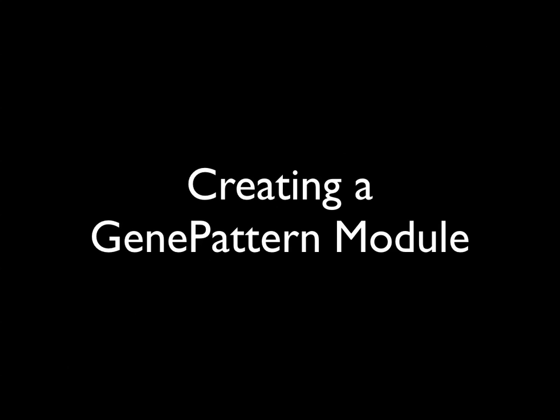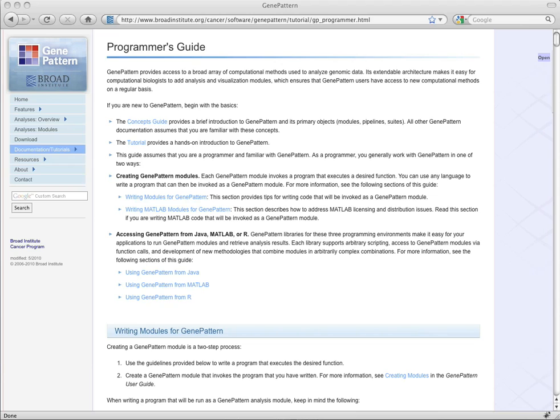Creating a GenePattern module is a two-step process. The first step is to write a program that executes your desired function. You can use the language of your choice, such as C or Perl. The GenePattern Programmer's Guide, found at genepattern.org, provides guidelines for writing programs that will be run as GenePattern modules.